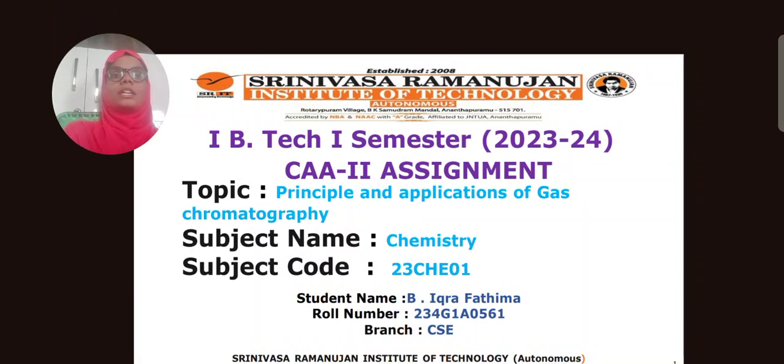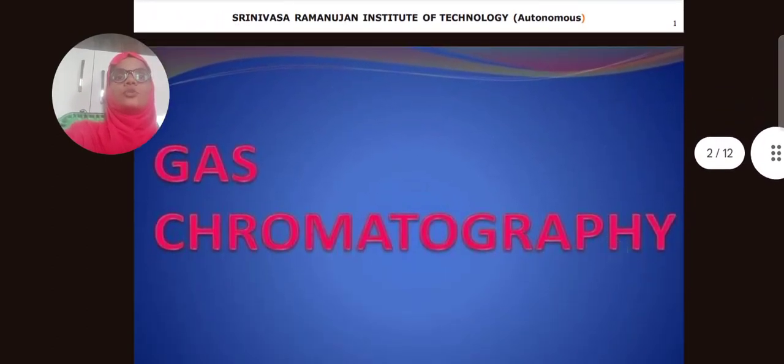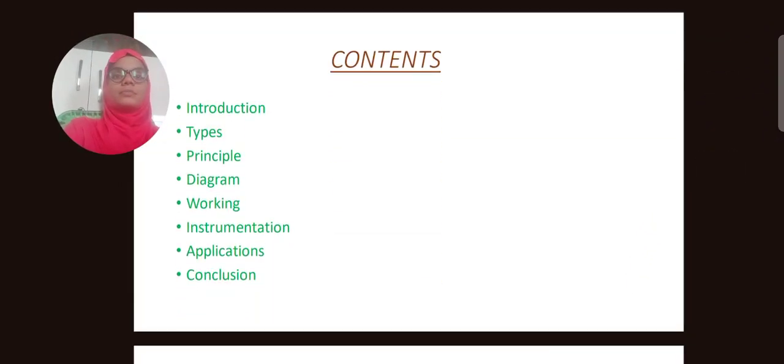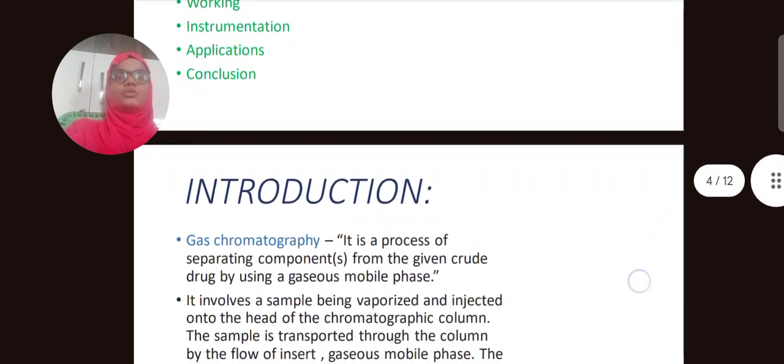Today my topic in the CAA2 assignment is Principle and Applications of Gas Chromatography from Chemistry. Gas chromatography contains introduction, types, principle, diagram, working, instrumentation, applications and conclusion.